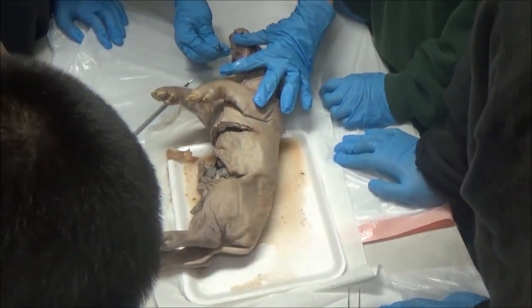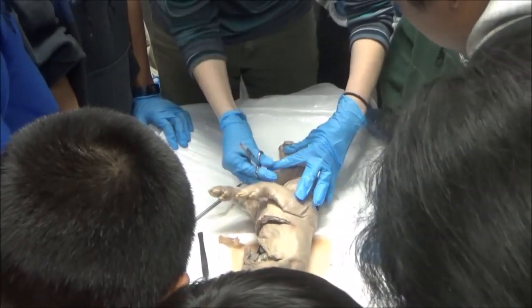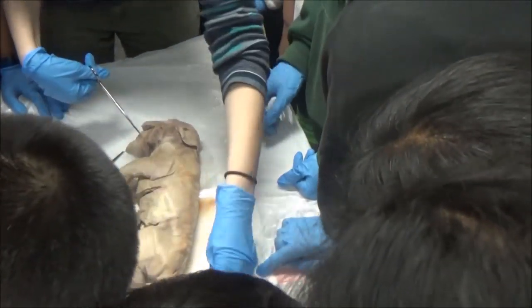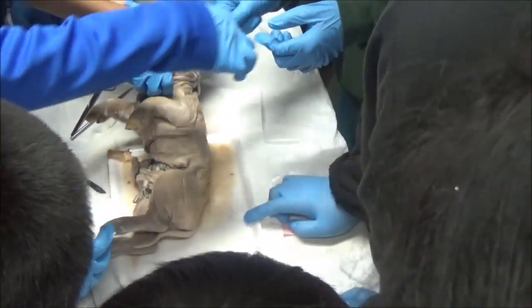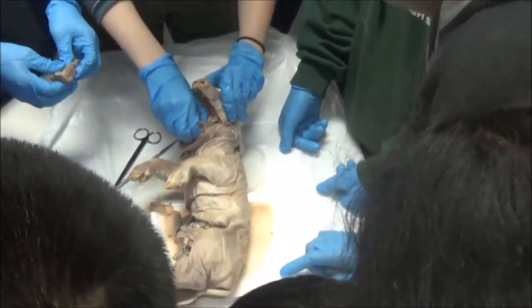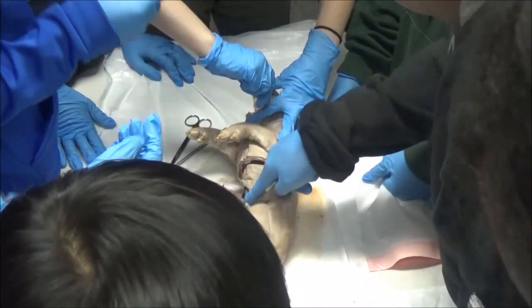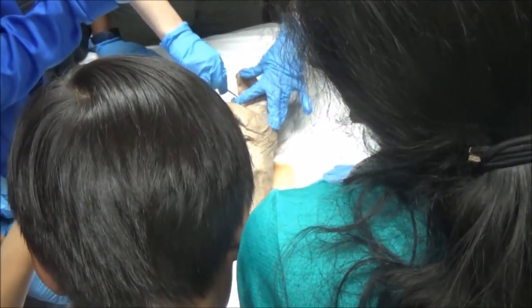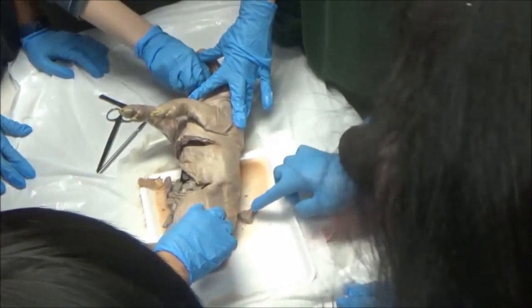Do you see this kind of cottage cheese texture here? That's a gland — glands have a cottage cheese texture, including salivary glands. Do you notice how the tongue is kind of ruffly? Is it like taste buds? Taste buds are too small to see with your bare eye. Instead, what you're seeing is called papillae — P-A-P-I-L-L-A-E.